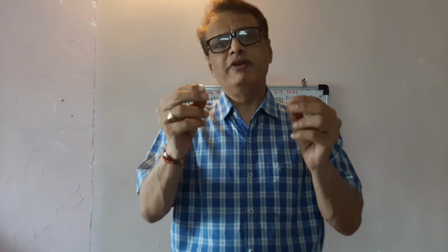When we perform dry test, at that time when we add dilute hydrochloric acid to the substance and if we get white precipitates, then there may be chances of first group. So we have to prepare our solution in nitric acid, dilute HNO3.